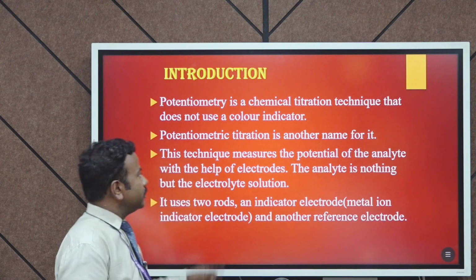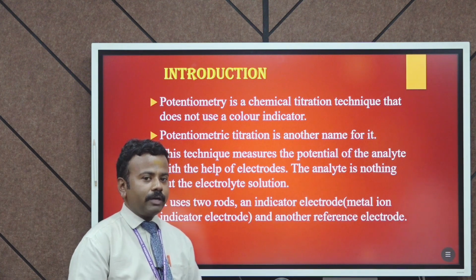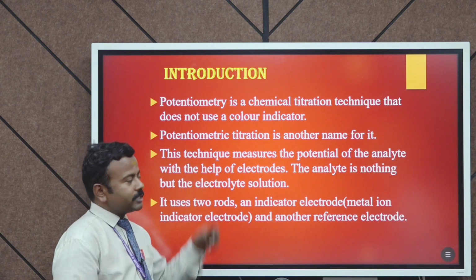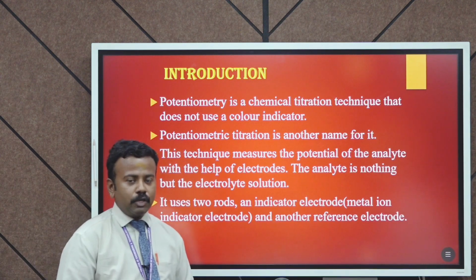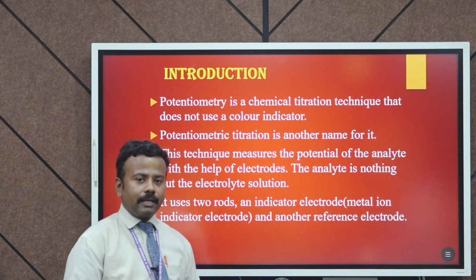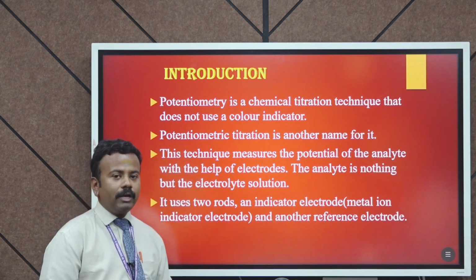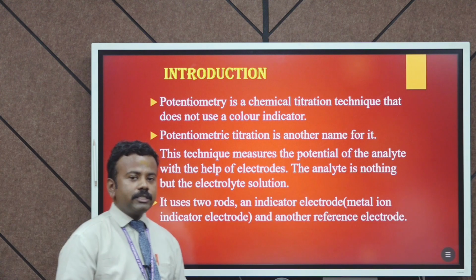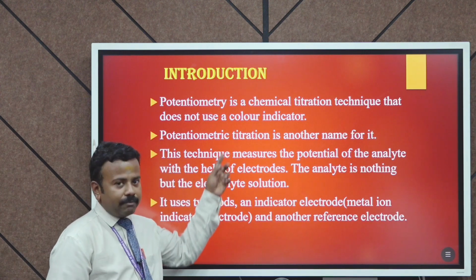In this introduction we discuss potentiometry. Potentiometry is a chemical titration technique that does not use a color indicator. So this is the first point. The second is that we may also call it potentiometric titrations, which is another name for it.